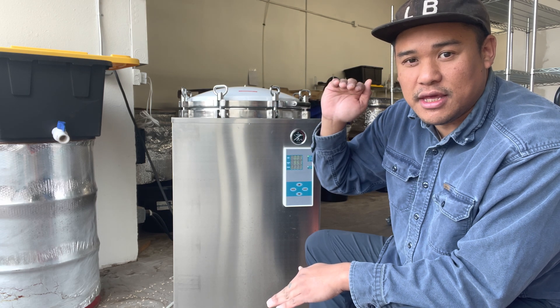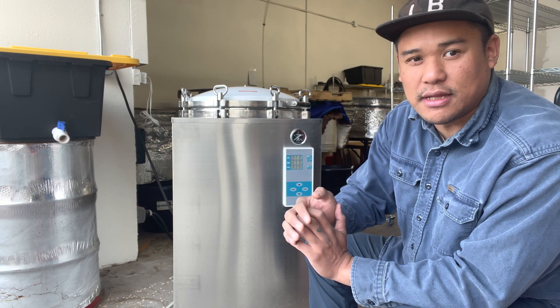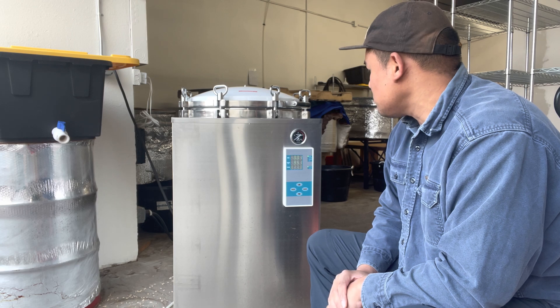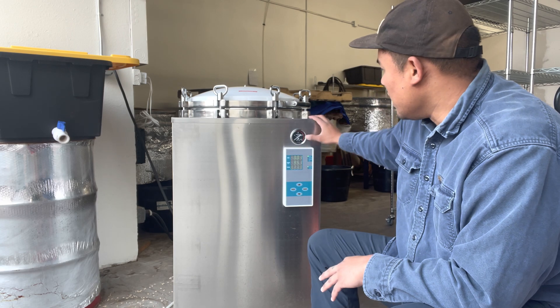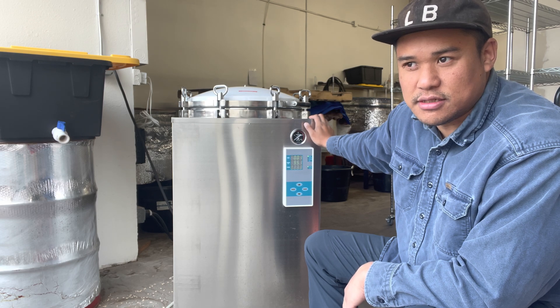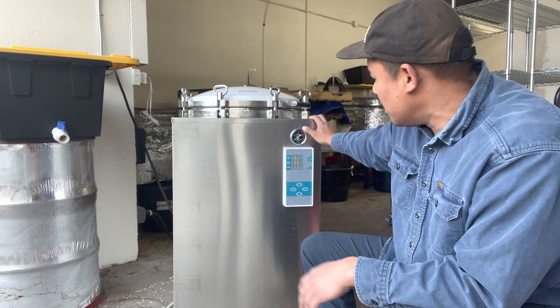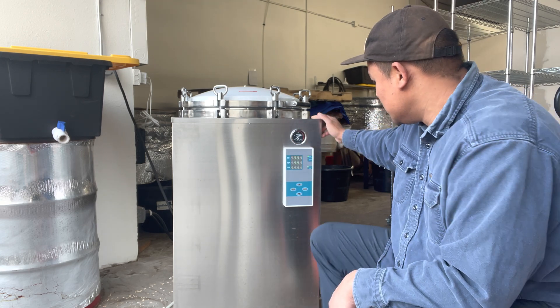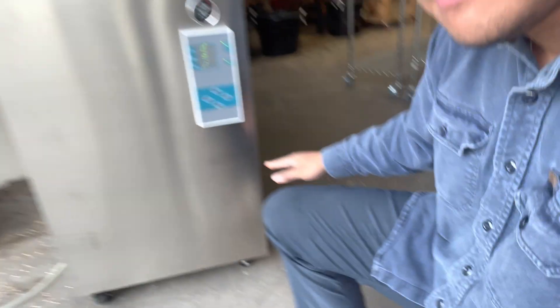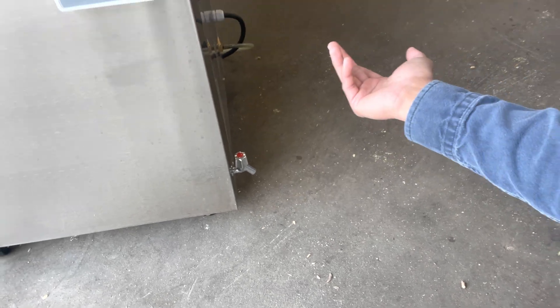Then the timer kicks on. So however long it takes to get up to my 15 PSI, the timer will kick on and count down from there. There are also a couple of gauges here so you can calibrate - if one gauge is off you have a backup to check on it. There is also a drain valve down here that's really easy to use, just turn it one way and you're good.